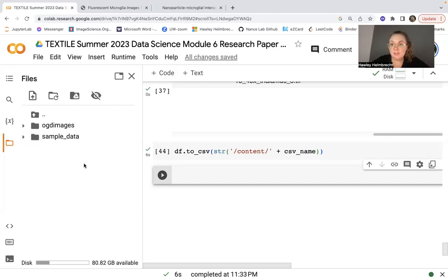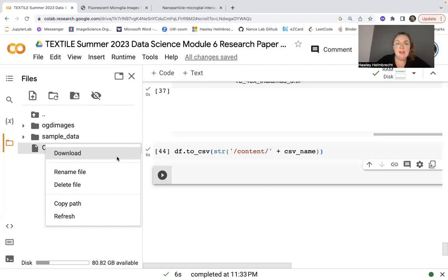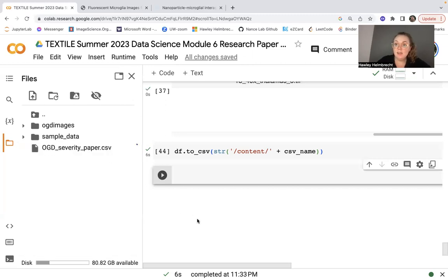And yep, that's everything. So I know it was pretty quick, but I hope that as you followed through, you could understand the purpose of why I was doing what I was doing, which was taking this work from just one simple image to hundreds of images and over 30,000 cells. And again, that's on the smaller side. Our more recent experiments also have Z-stacks, so their images are much larger. We include both sexes. I analyze them at multiple magnifications. There's a ton of really cool things you can do. And although I'm showing this applied to microglia, it is not necessarily specific to that cell type.